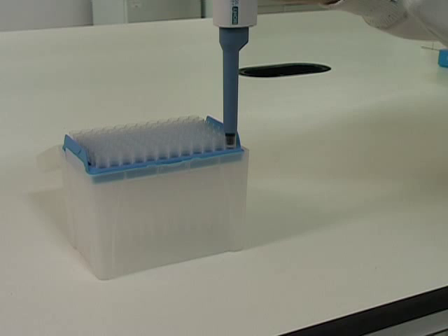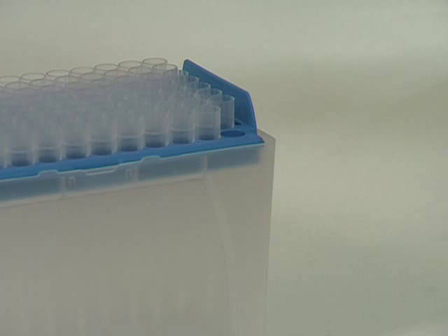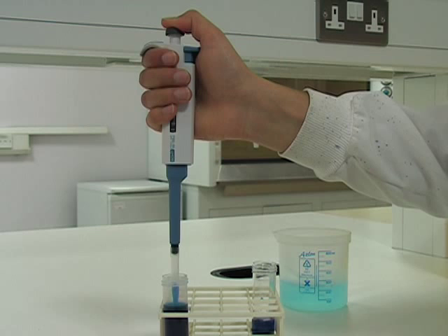Next, the operating button is depressed to the first stop and the pipette tip is placed into the liquid, and then the button is smoothly returned to the resting position. The tip should be placed a few millimeters below the surface of the liquid.